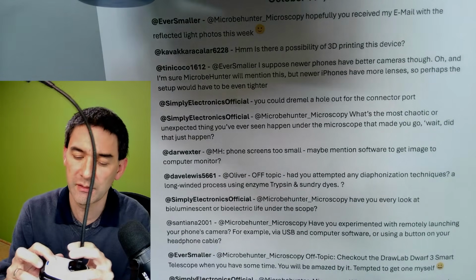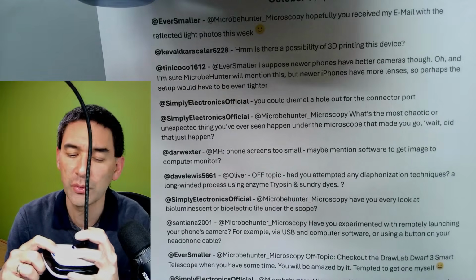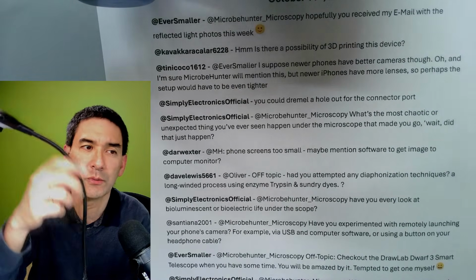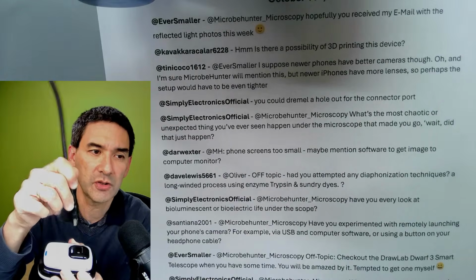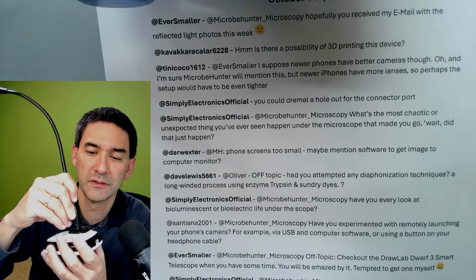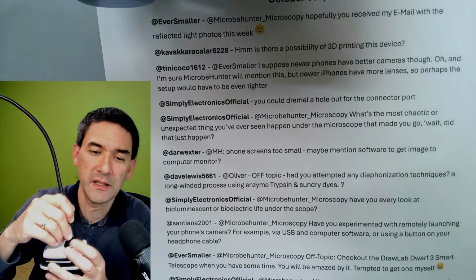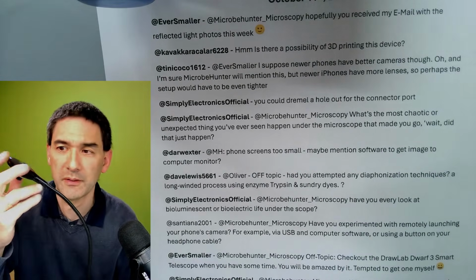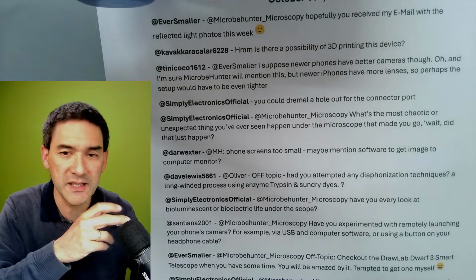So it's called the Hue, and it's basically just a USB camera on this one neck. You can actually detach it here. There's also a USB connector over here. So that's also a possibility, but you need to set it up every time, because of course it's flexible.